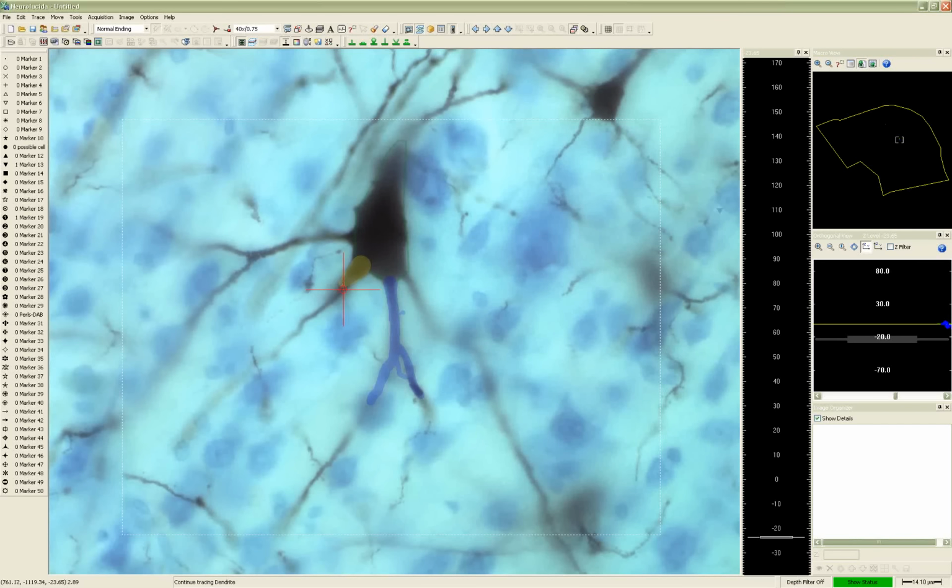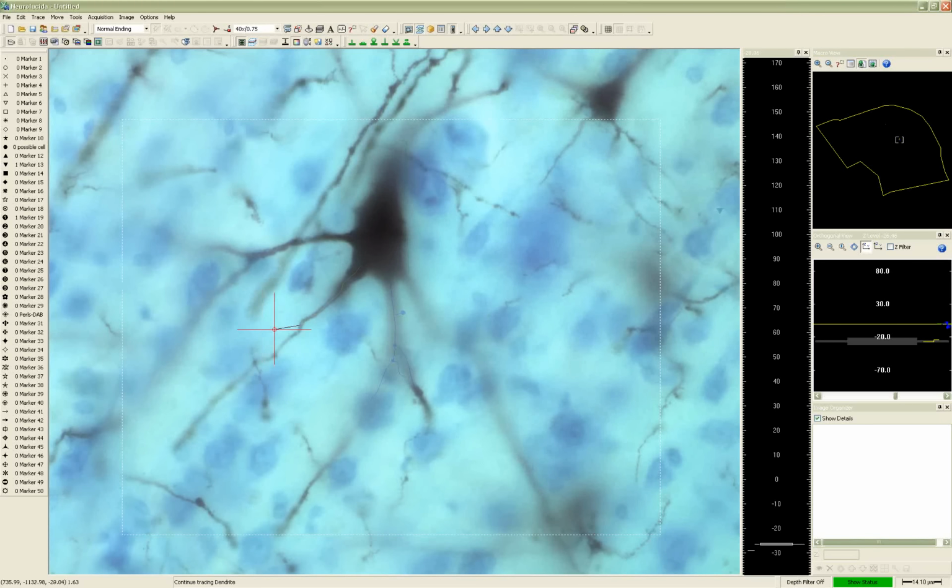So when you adjust the opacity of the tracing, the color is not as vivid. So I can turn thickness off so that you can see the difference between tracing with and without thickness. Personally, I like to have thickness on so that I can make sure that I'm adjusting the cursor properly as I'm going along. It makes it easy to identify mistakes that I might make as I'm tracing.